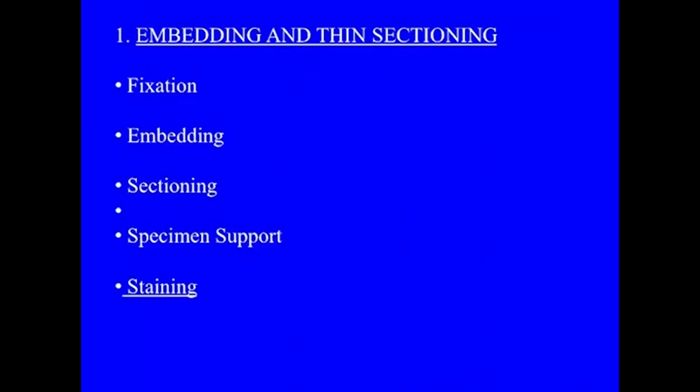As we go along, we will discuss various ways to create contrast. So, let us see the first method. Now, if you could recall, the specimen preparation in light microscopy involved fixation, dehydration, embedding and sectioning, and likewise here also we follow the same steps, but with certain differences. Now, first is the fixation.